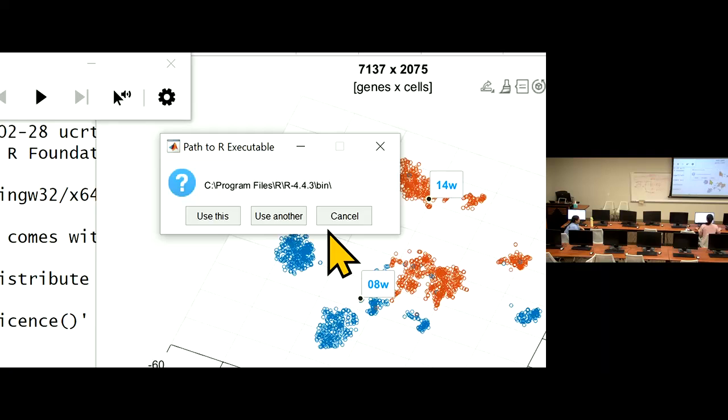And from here, you found setup. Click this, and you are done. Mm-hmm. Yeah, then you load the example. Okay.